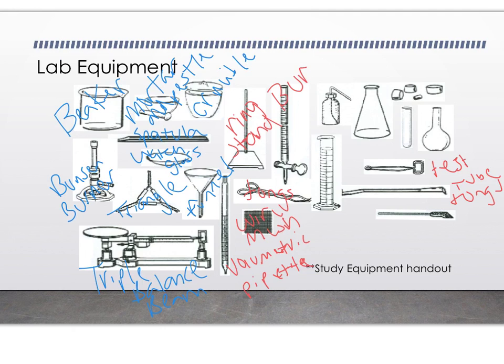This next one is a burette, and this helps allow different volumes of liquid, very, very small amounts of liquid, into a reaction container, as small as 1 drop going into your reaction container. So if your measurement has to be very precise, you would use a burette. This is important for acid-base chemistry whenever we do titrations.